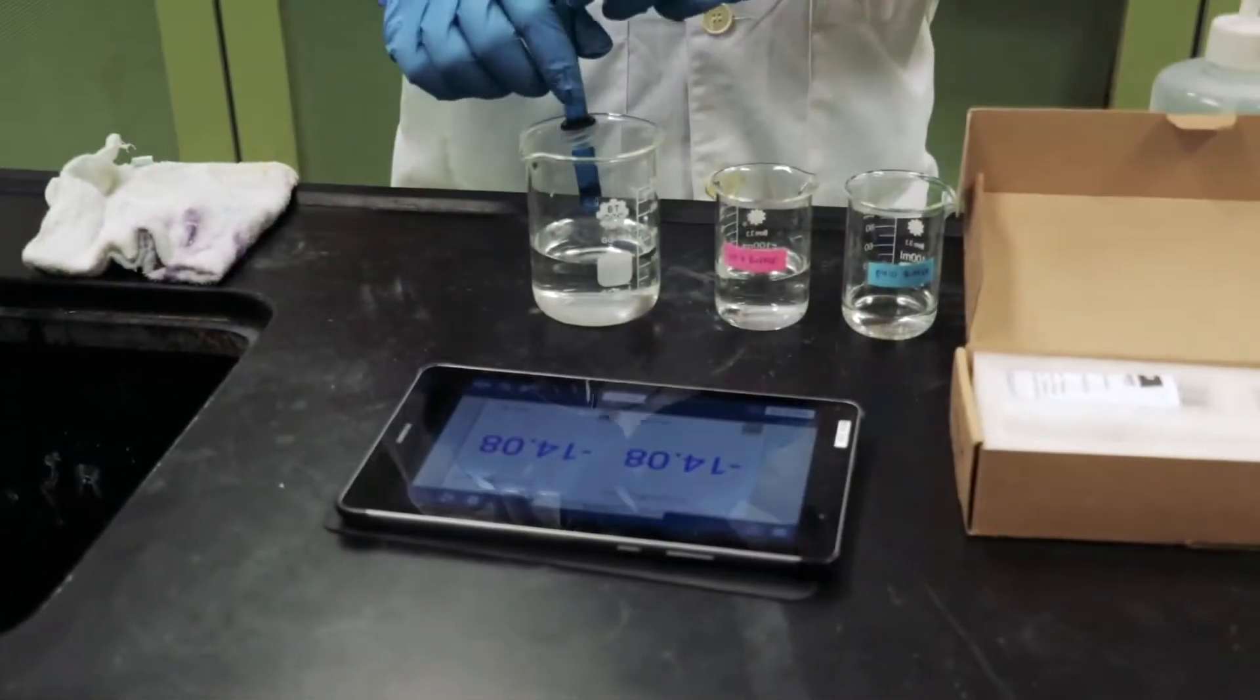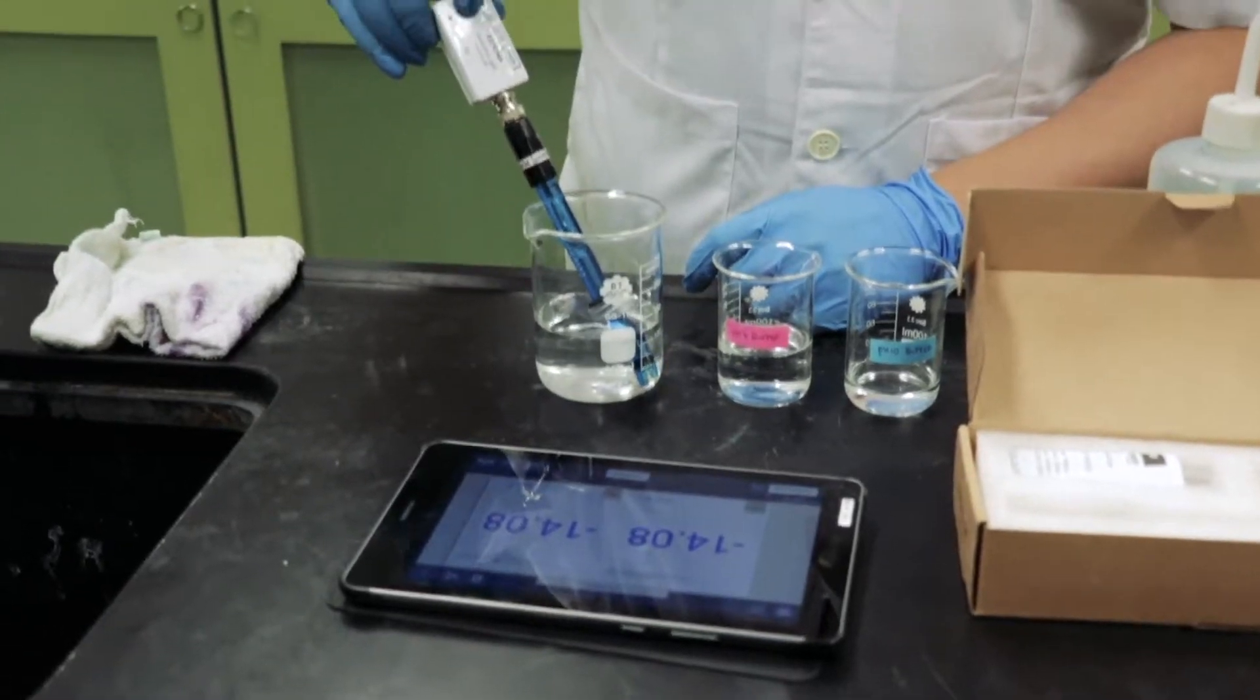To calibrate the PH Probe, launch the Spark View app and select Remote Logging.